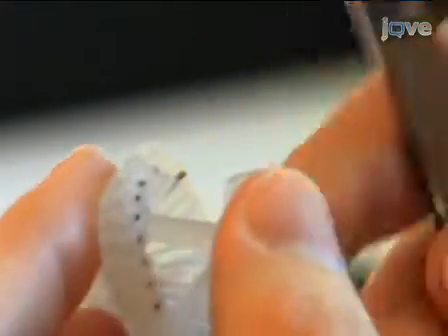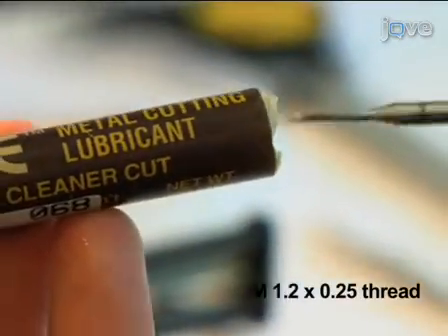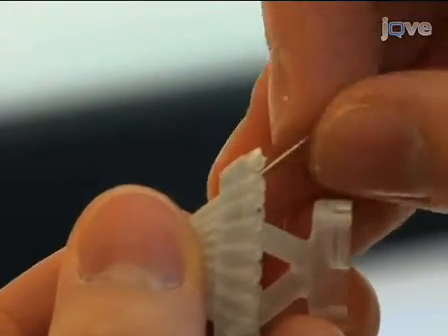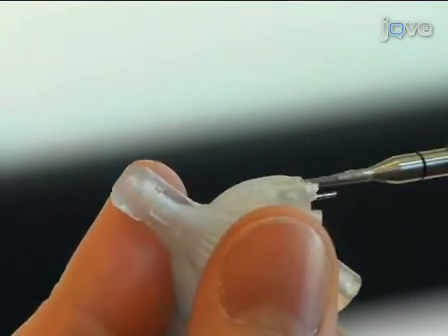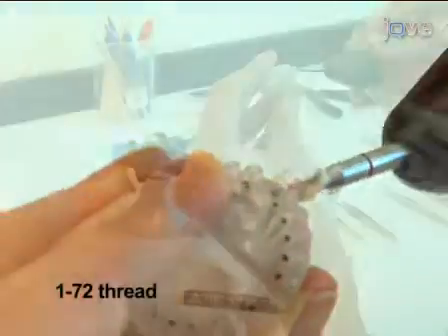The screw pilot holes now need to be threaded. Use a pin vise to hold the tap and apply a dry lubricant before tapping. Align the tap and its hole by making sure it is parallel to a 23 gauge tube you temporarily insert into the neighboring sleeve. The holes that hold the interface board and the protective cone need to be threaded. Hand tap these holes the same way.